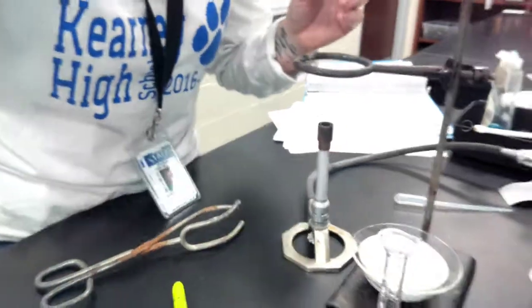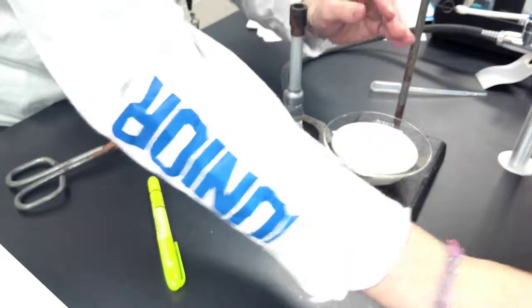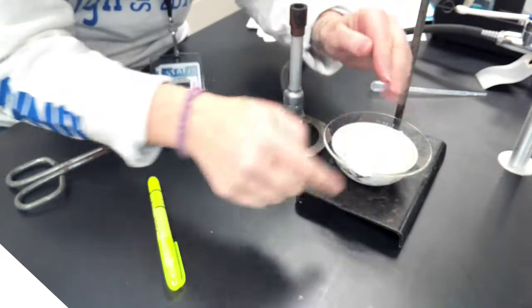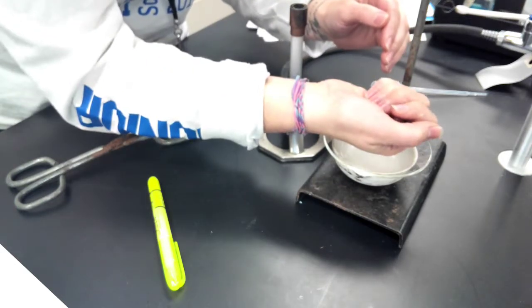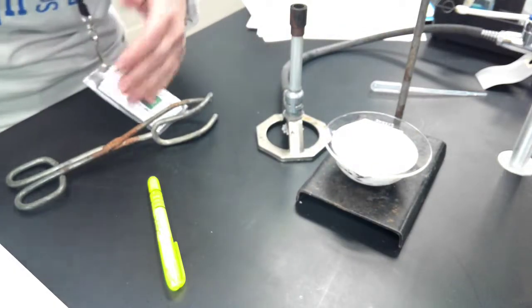I'm going to keep this system together. I'm not going to remove the evaporating dish because there's going to most likely be salt stuck to the bottom of it. So I'm going to cool it on the metal base. I'm going to put my hand above it, feel for the heat radiating off of it. When no more heat radiates off of it, then it's safe to transfer to my balance and mass it.